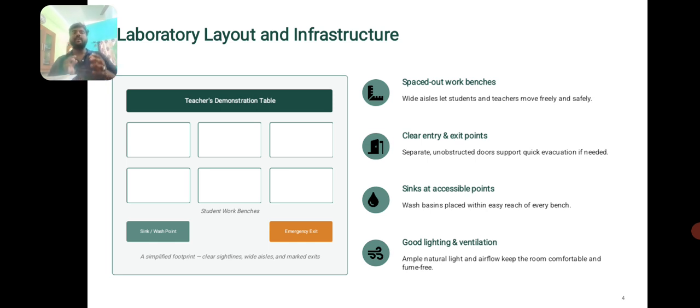That means separate unlocked doors for quick exit if an emergency arises. Next, sinks in accessible points, wash basins placed close to workbenches, for when an emergency arises.